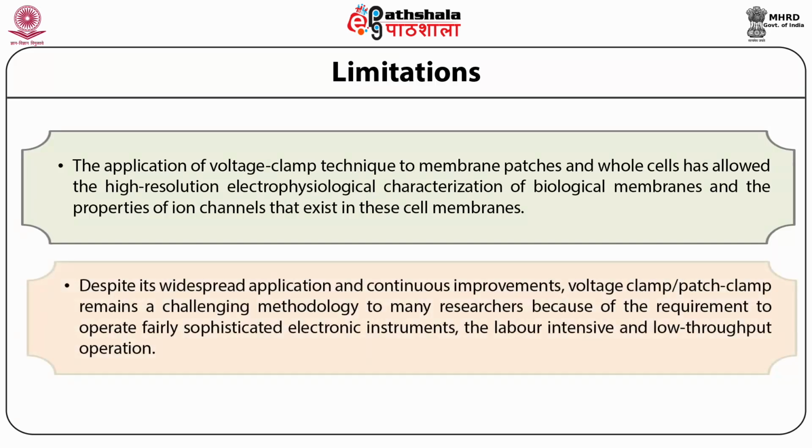Despite its widespread application and continuous improvements, voltage clamp or patch clamp remains a challenging methodology to many researchers because of the requirement to operate fairly sophisticated electronic instruments in a labor intensive and low throughput operation.